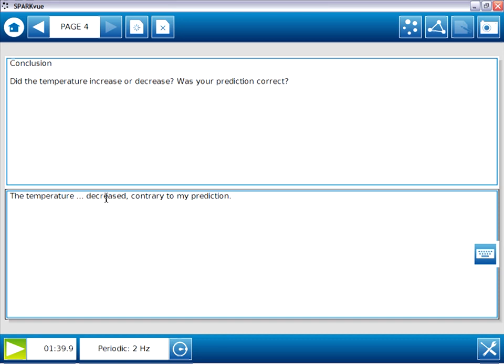In this movie, we've seen how we can use the basic authoring technique and the SparkView software alone to fairly quickly create a functional SparkLab. Now this lab works fine. I think it conveys the idea, but it does look a bit plain. So in the next movie, I'm going to show you how the enhanced authoring technique can be used to make a SparkLab that looks even better.